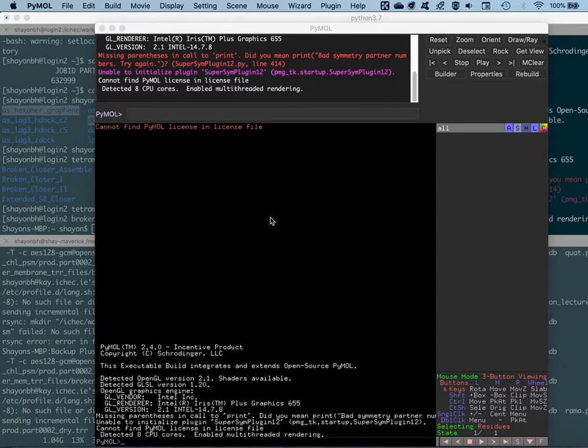Glycine does not have a side chain, which allows it to attain several positions in the plot, mostly the turn or loop regions, whereas proline has a five-member cyclic side chain, which poses steric restrictions on its movement, mostly occupying the phi region. These restrictions allow it to occupy only a certain region, at a phi angle of negative 60 degrees.